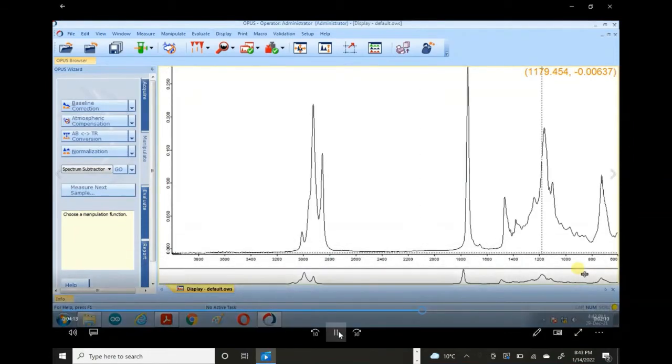So this is the absorbance spectrum which is obtained. If you look clearly, if you can recollect from our tutorial video, the spectrum is the same. The only difference is the one which I have shown you is for transmittance. However, this is for the absorbance spectrum.